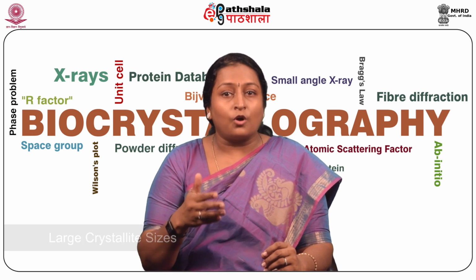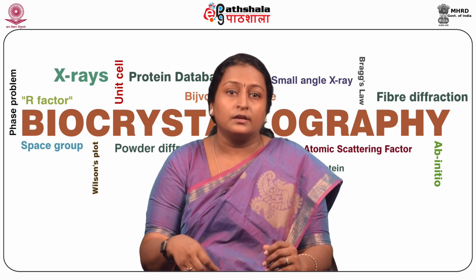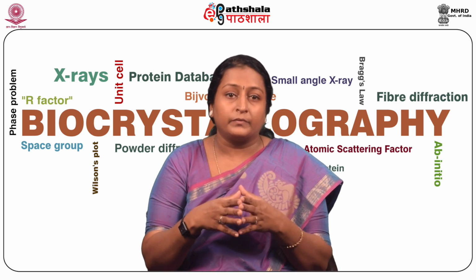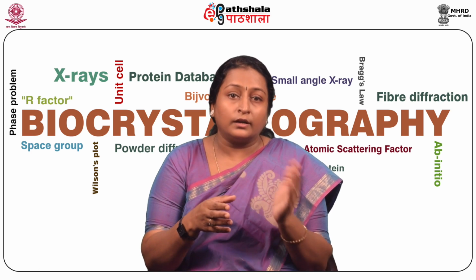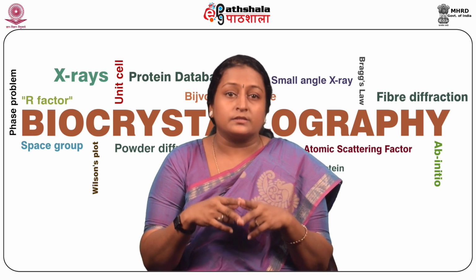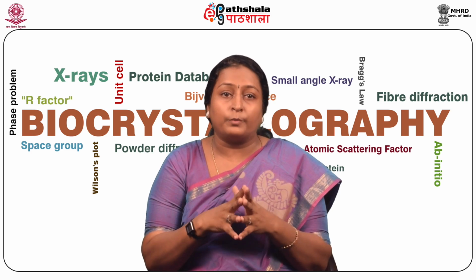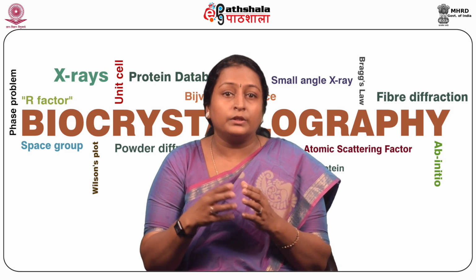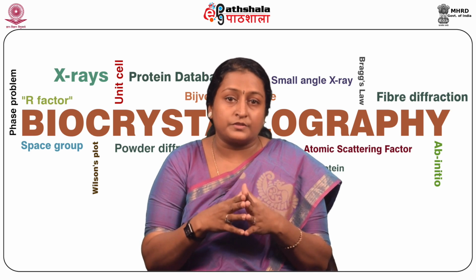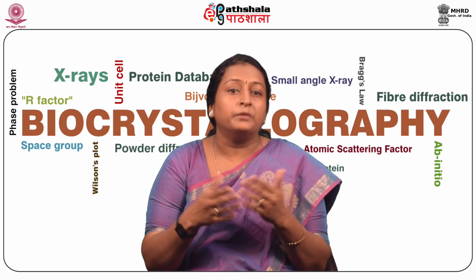Large crystallites and non-random crystallite orientations both will lead to peak intensity variations. The measured diffraction pattern will not agree with what is expected from an ideal powder. The measured diffraction pattern will not agree with the reference patterns stored in the powder diffraction file database. These methods are necessary for mounting small amounts of powder. The methods help alleviate the preferred orientation. The constant volume assumption is not valid for this type of sample, so quantitative and Rietveld analysis will require extra work and may not be possible.